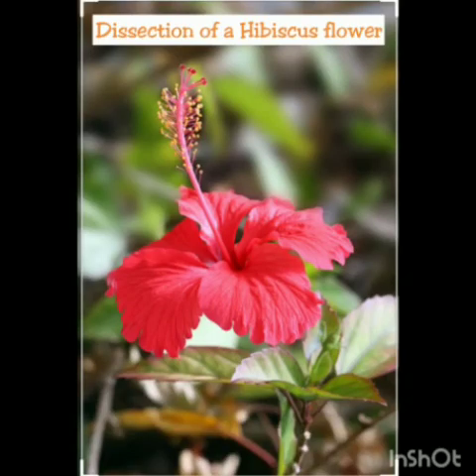Namaste everyone. Today we are going to dissect a hibiscus flower and see the reproductive parts in it.